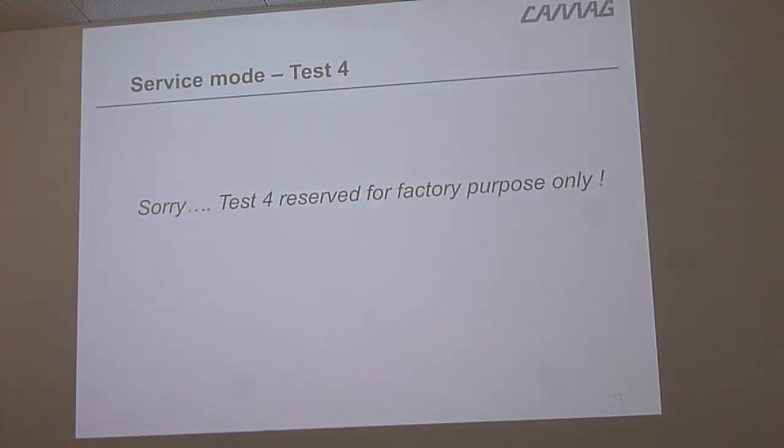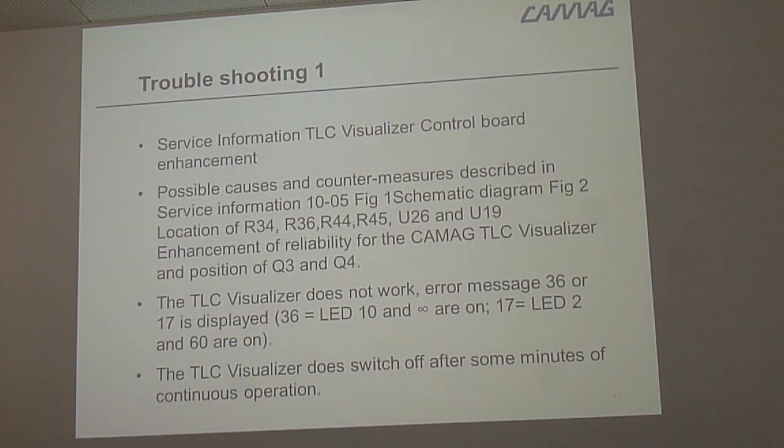So this is also this service mode, which is not really important. Troubleshooting, I just mentioned here some issues. As I already said, we had this issue around 2010. There were some changed parts, and therefore we had this problem. This problem is solved, so you won't have this issue.